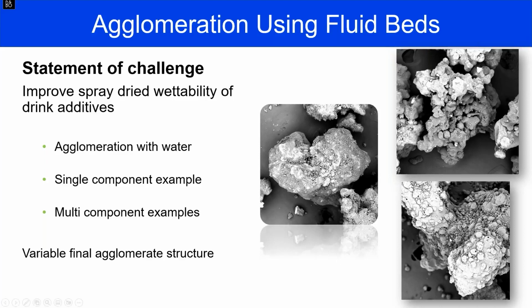So, the answer was I got wettability and I got density. Maybe that was good. Up here, I got wettability and I didn't get density. Maybe that was good. So it depends on what your customer wants and how it's going to operate. I think that all of these samples could have been made to have better wettability by making more of that grape cluster structure, but I think the final product would have been weaker, and we could have seen more fines in a case like this.